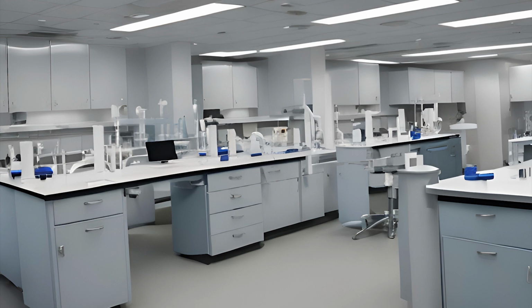According to OSHA, all procedures involving blood or potentially infectious materials shall be performed in a manner such as to minimize splashing, spraying, splattering, and the generation of droplets of these substances. Because of that, disposable transfer pipettes should be used when transferring serum or plasma into an aliquot tube. You should be working behind a benchtop splash shield, and you shouldn't be pouring from one tube into another. You use a disposable transfer pipette to transfer into your aliquot. That will minimize the risk of a splash, spray, or splatter.